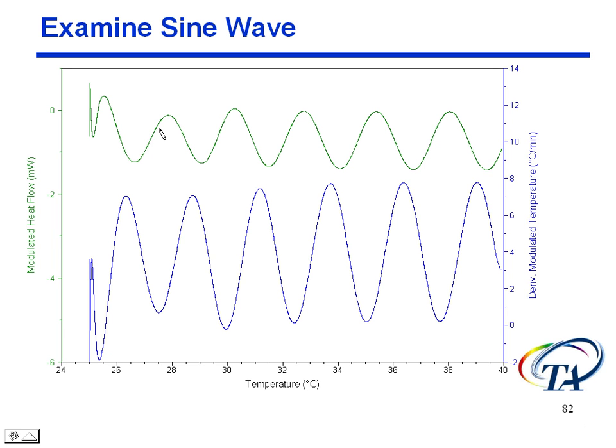I'm not seeing something that looks like a double peak. I'm not seeing something that looks like a square peak. I'm not seeing something that looks kind of skewed. Those things would tell me that I'm not under modulation control. I'm not controlling the data like I expected to. And maybe it's because I'm at the very bottom end of the range of this instrument. Maybe I have too big a sample. Maybe I'm trying to go at too high an amplitude. But this is a good thing just to look at the data and say, okay, do I feel like the data is in good shape?